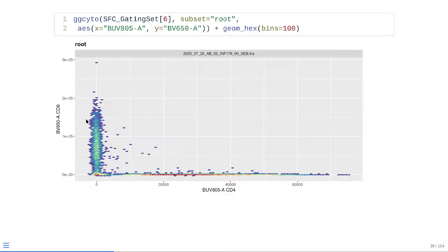This is typical for many fluorophores because although a lot of the space is being treated linearly, especially around that negative population, when it comes to cells that are staining for a particular fluorophore, there can be lots and lots of logs of difference between the cells that are just dimly staining for it and those that are super bright for it.